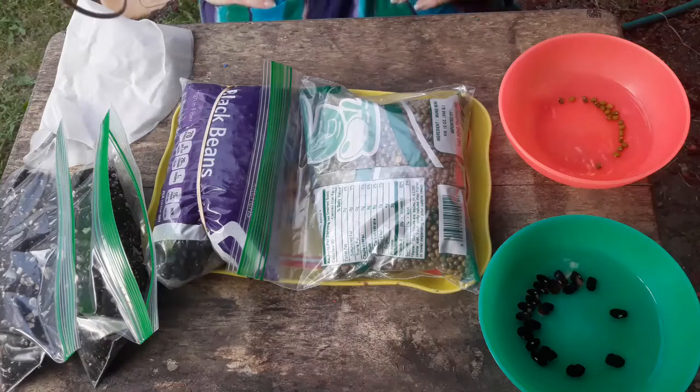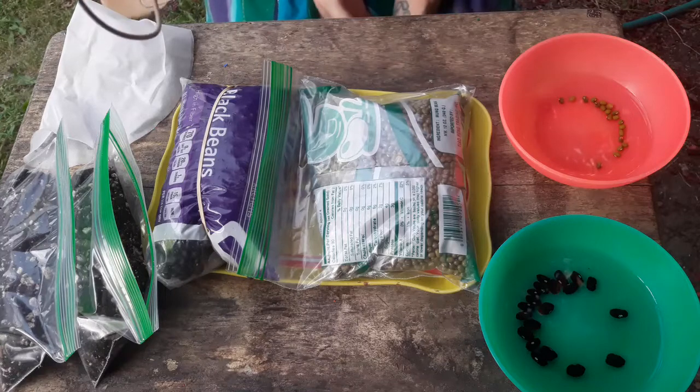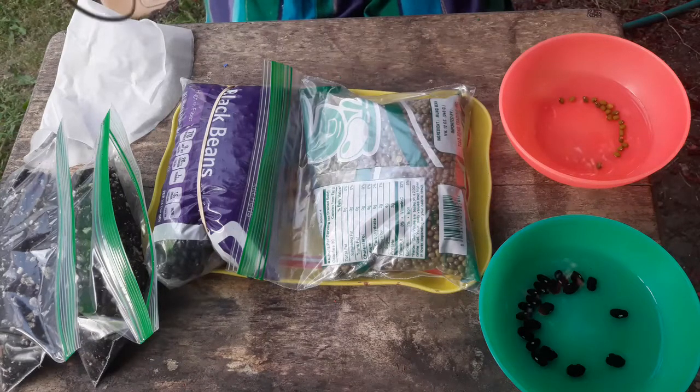We're going to do something called a direct germination test, which is used typically by most seed companies to determine what their percent viability is whenever they want to market something. Usually they take a random sample of a hundred seeds out of a couple of different batches and do sowing tests to see what the percentage of viability is to determine the marketability of the seeds.